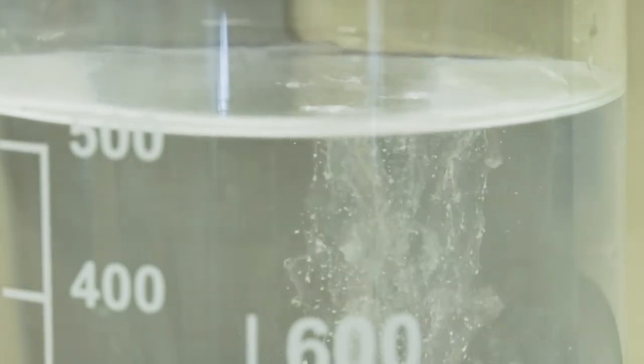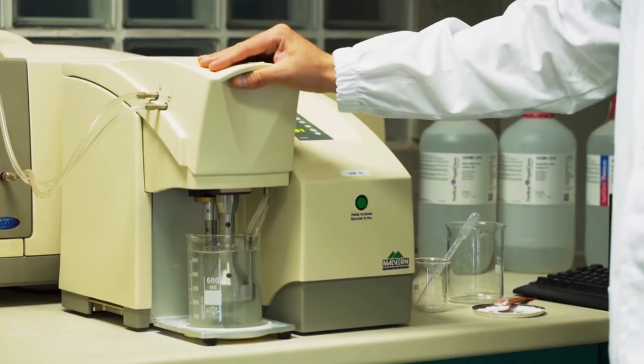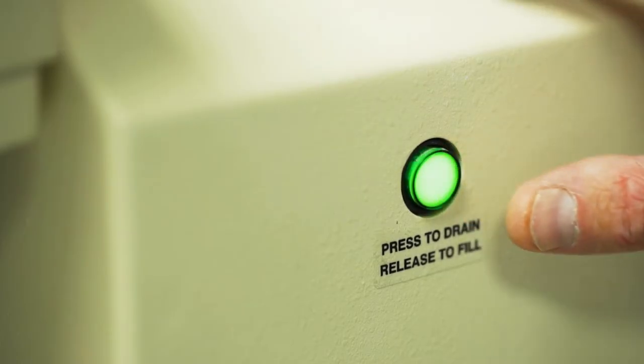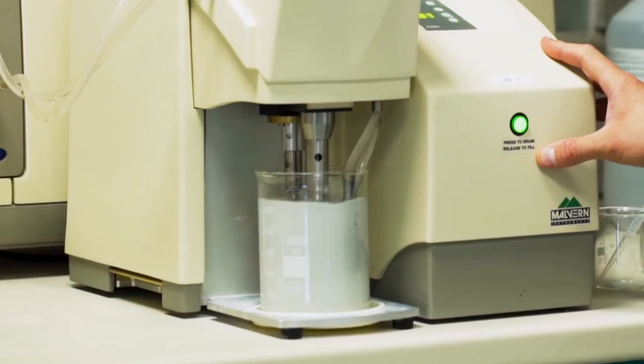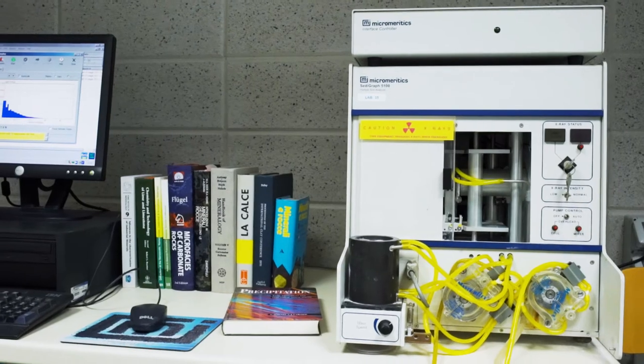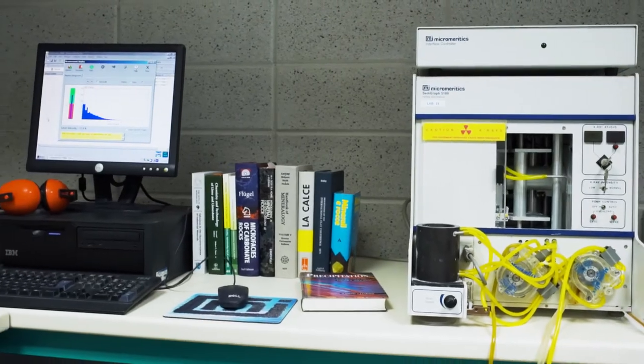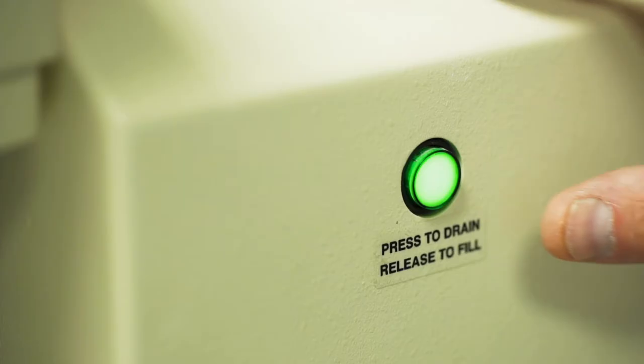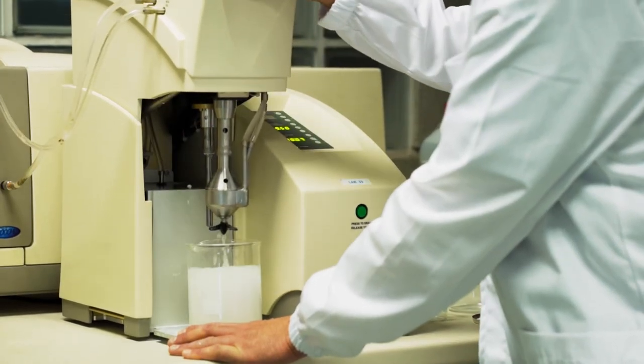The spectrophotometer allows evaluating the brightness. Finally, the XRD analysis allows performing the quality control in terms of mineralogical crystallographic features, including information related to the residual calcium oxide content.